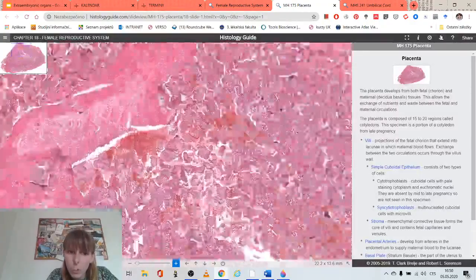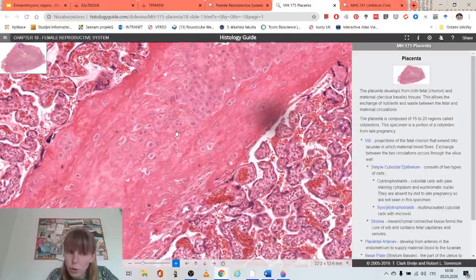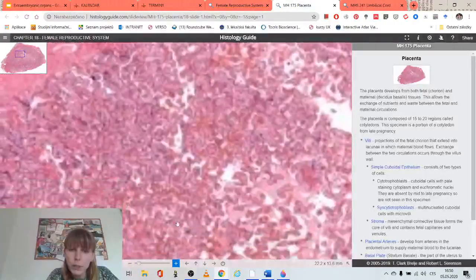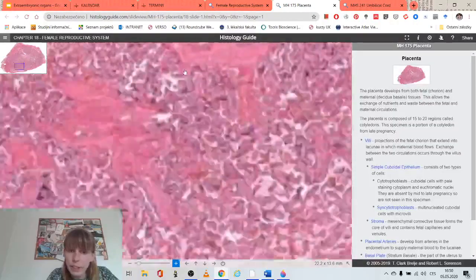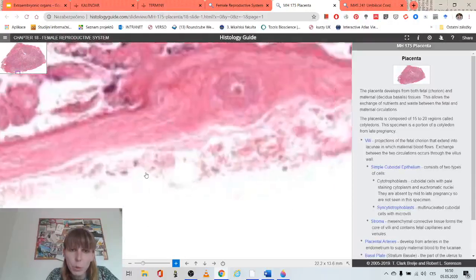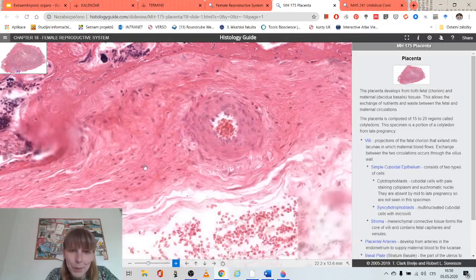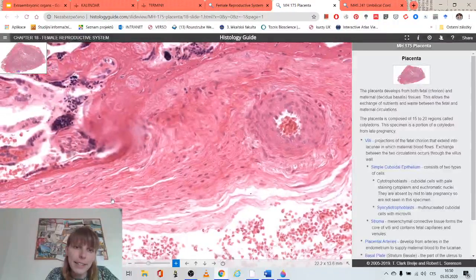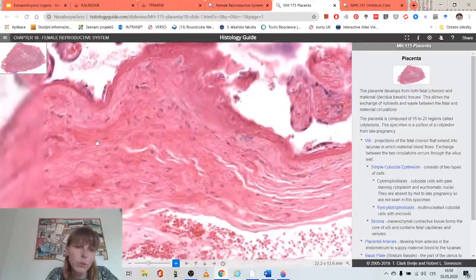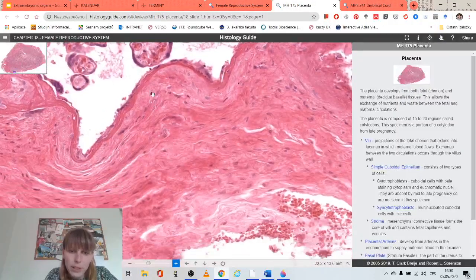So I hope the decidual cells are quite clear. They should be really easily recognizable, and when we go to the other side, you will see that there's nothing similar over there. So when we zoom in here, this is basically connective tissue. So you don't have to worry about mistaking these two. I don't think so. So this is the chorionic plate.